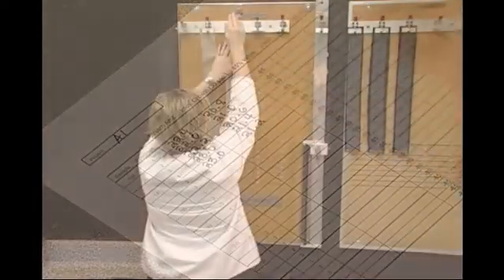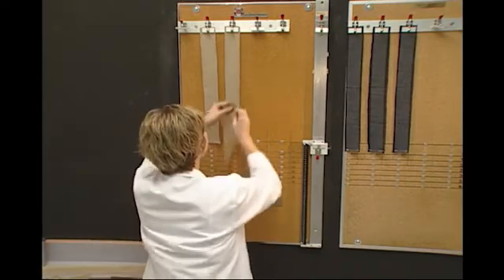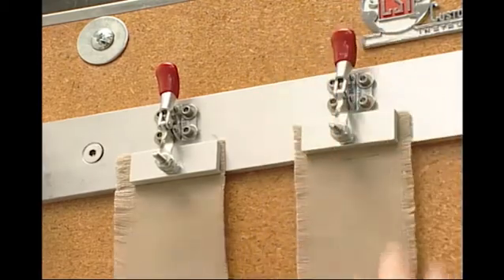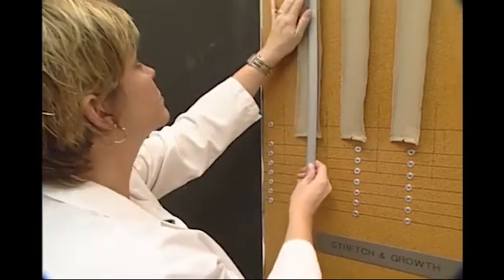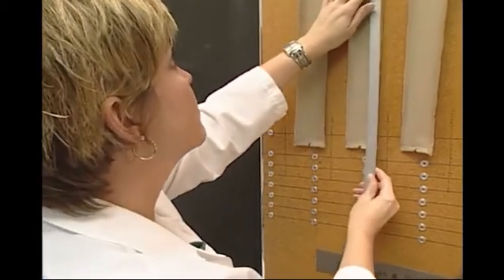Testing for the fabric attribute of growth after stretching to a specified extension uses 3 specimens that are cut, raveled, and one edge sewn, as were the specimens for the stretch and growth by the applied tension test method. The distance between the lower edge of the top clamp to the 0 stretch mark section on the test frame is 20 inches.